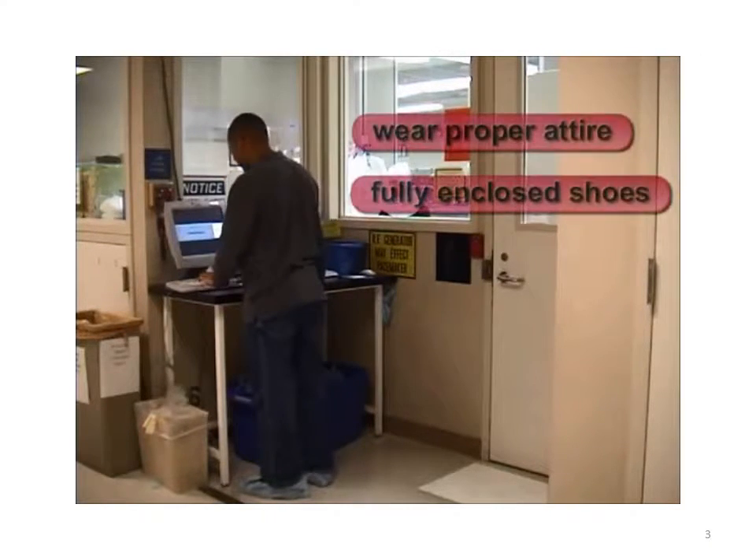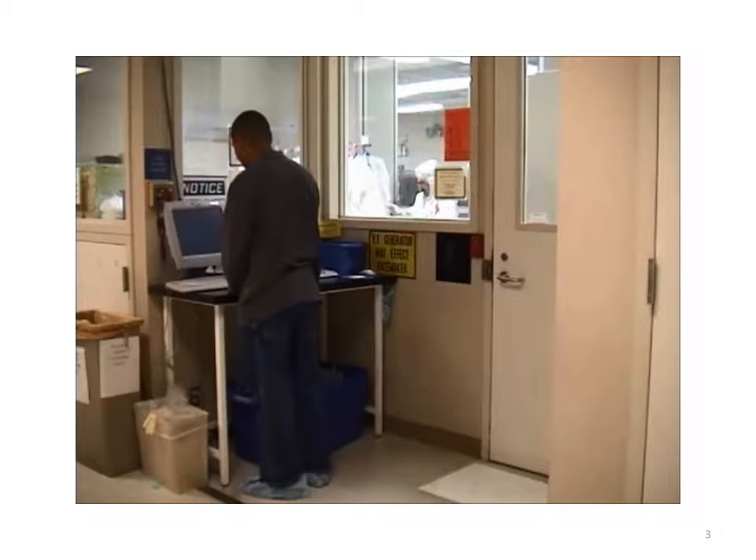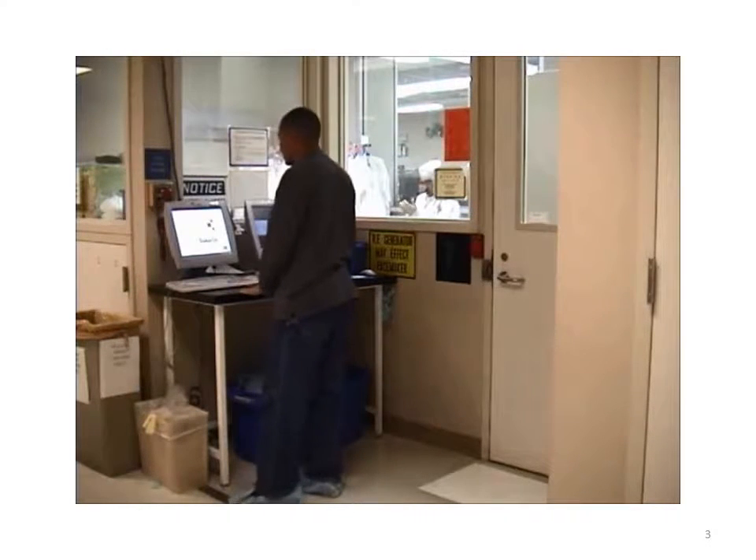Please wear appropriate attire. Shoes should fully enclose the feet — no sandals, open toe, or sling back shoes. Shoes should be made of non-porous materials, not nylon or mesh. Check your shoes to avoid tracking dirty debris into the gowning room. Please remove outer clothing, especially fuzzy sweaters.